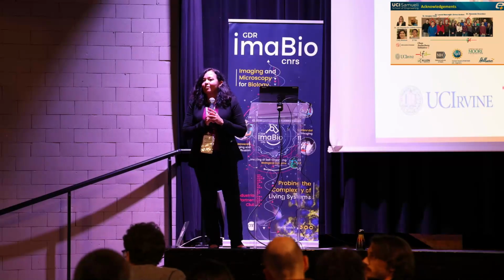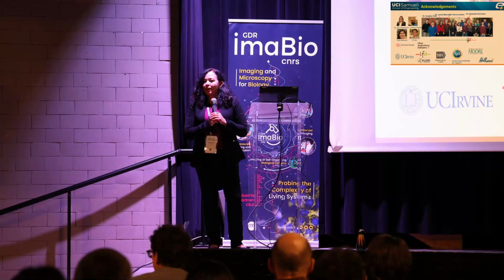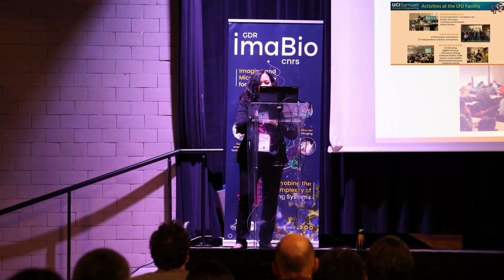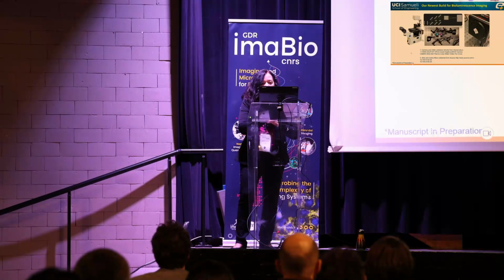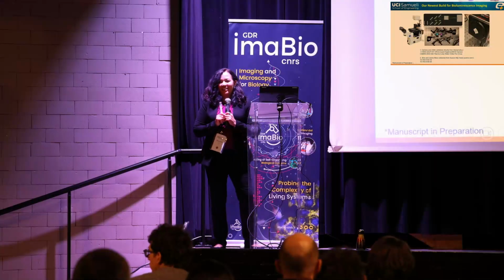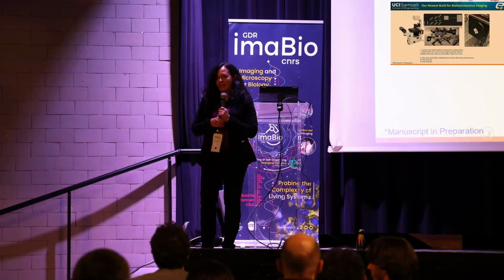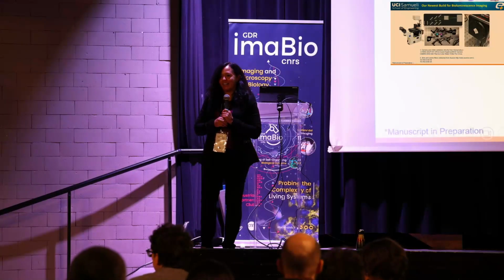So it's a bandpass filter, or a type of filter that is like a, I can talk to you about that. It's a specially custom-made filter that has thin coatings on it.